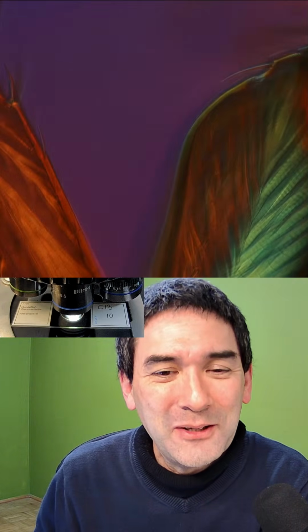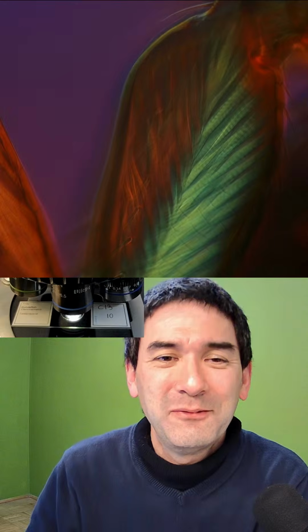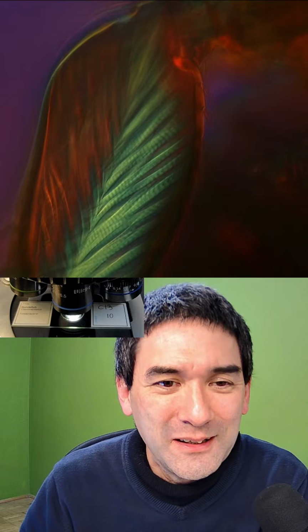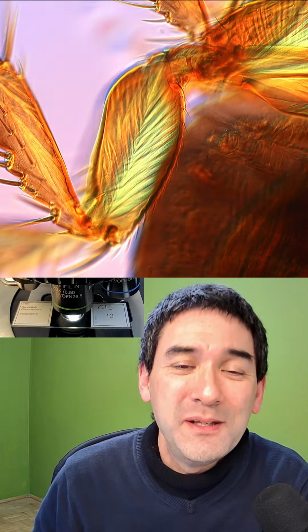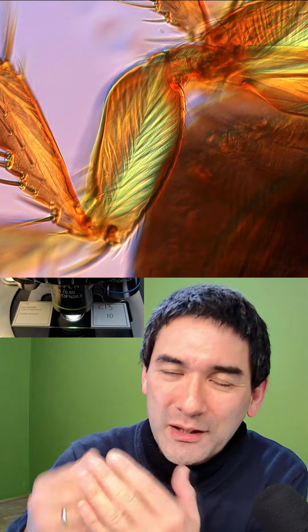If we zoom in here, that's the other thing that I want to do. Look, this also looks quite nice. And what do we see again inside the flea? Again, the muscles, right? And again, you can see those stripes that we talked about. So there is the commonality of life, as I call it. Again, you have those light and dark bands inside the muscles. It's quite a nice one. Again, this one was also one of those specimens that are a little bit too large, so I had to stitch them together to make a nice picture.